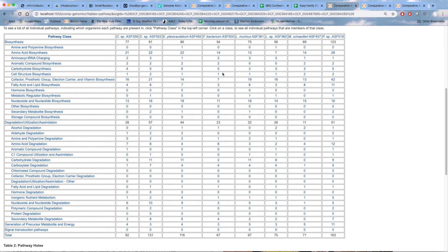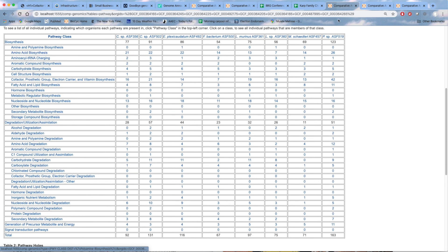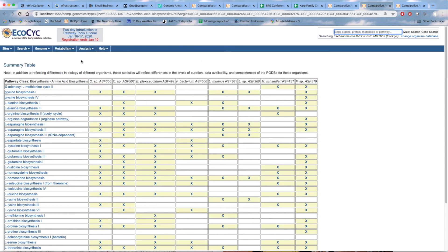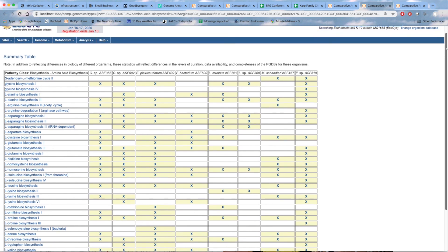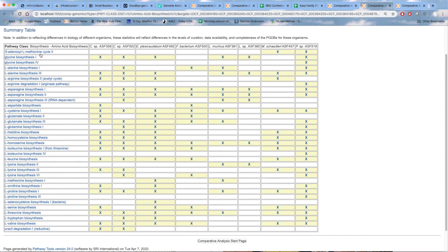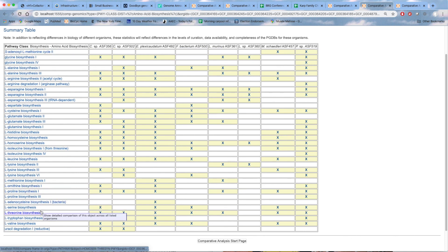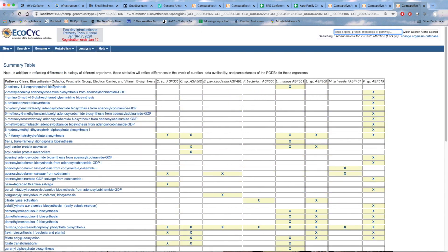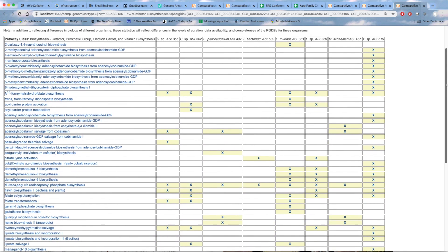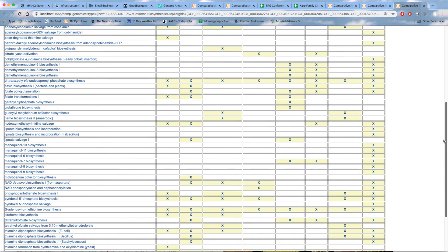If we want more detail on any of these rows, we simply click over here. For example, I clicked on the amino acid biosynthesis and I get a summary again across all the different organisms of specific individual amino acid biosynthetic pathways present in those organisms. And here I've clicked on the cofactor biosynthesis, and we get a summary of all the cofactor biosynthesis pathways present in each organism.